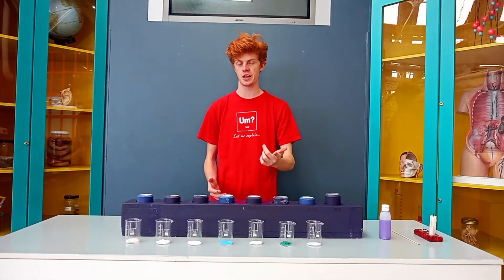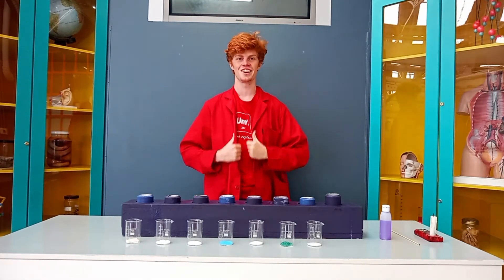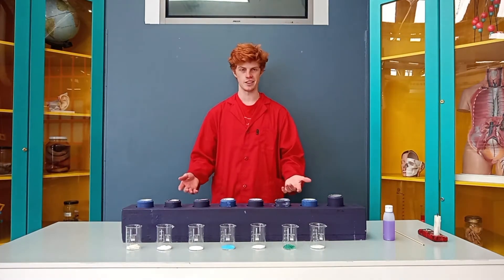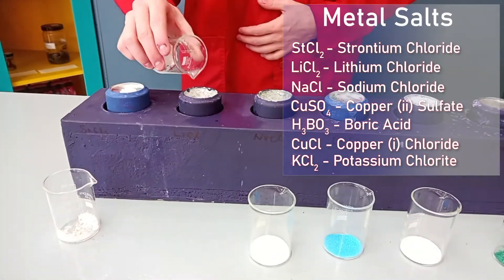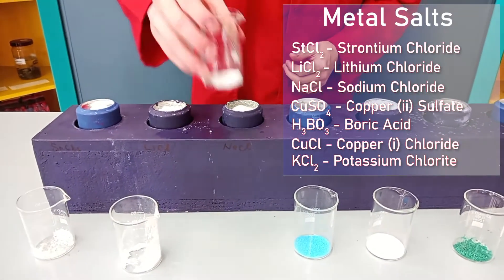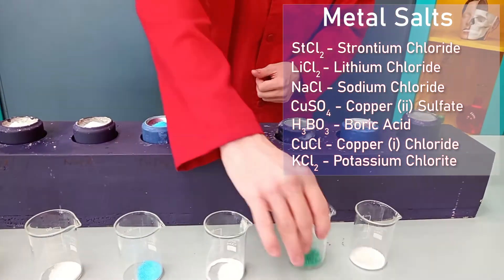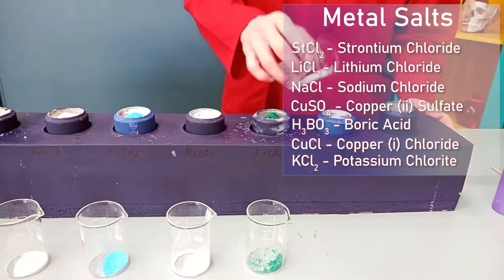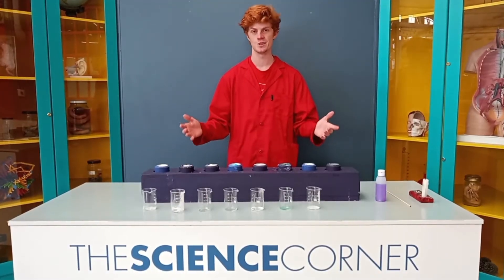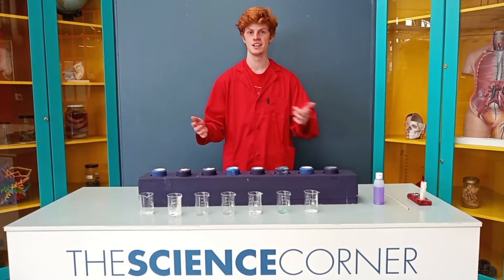Before we begin, let's not forget about safety and let's put on the lamp grid. Now let's get started by adding the containers first. Okay, now our experiment is ready — let's head over somewhere darker where we'll be able to see the fires brighter. I'll meet you there.